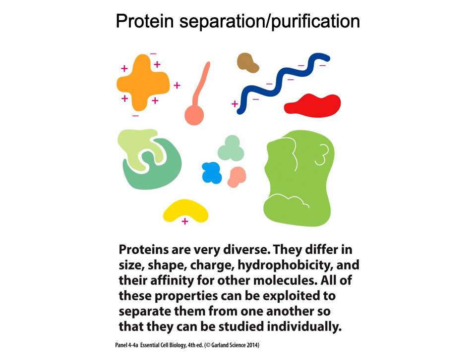And so all of these different properties can be utilized in order for us to isolate proteins so that we can then study them individually. Because the reality is, in a cell, we have this mosaic of different proteins that are present, and these proteins are interacting. If we want to study those interactions, or where the protein is located, we need to be able to eventually separate them out.